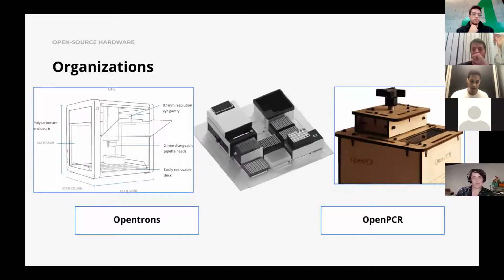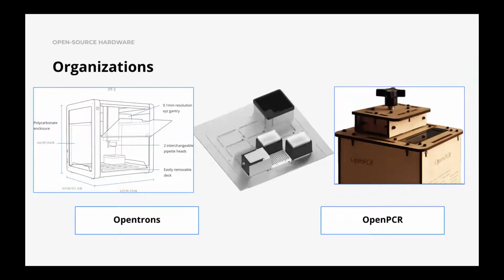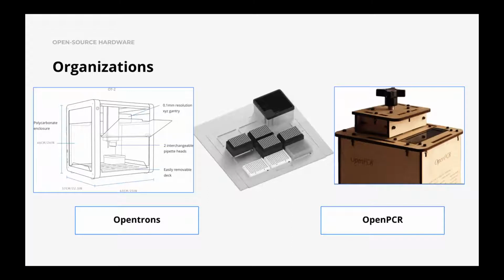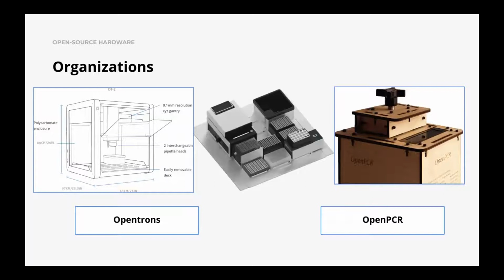And this is basically a core tenet of synthetic biology, moving liquids around, doing things like nucleic acid extraction. If you wanted to set up a PCR reaction, NGS library prep, those all kind of require some sort of liquid handling upstream before you can do that downstream application.